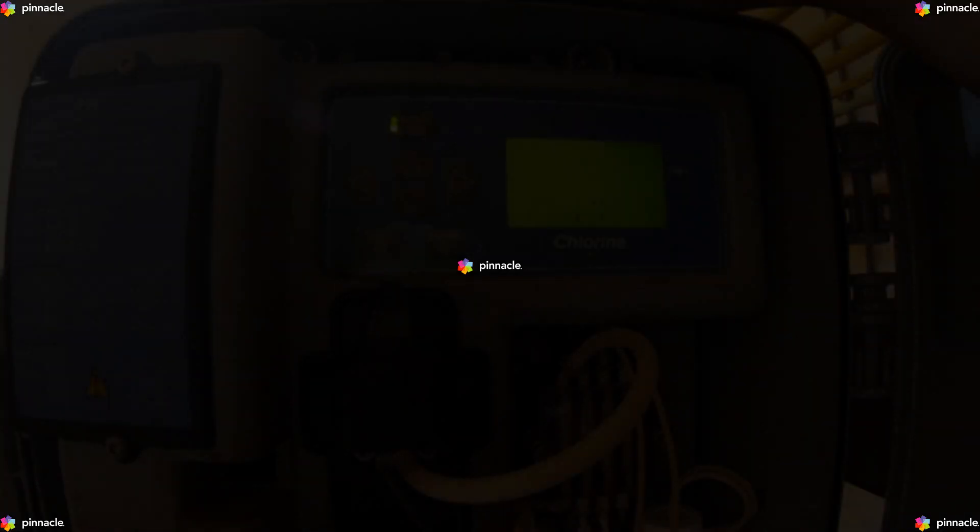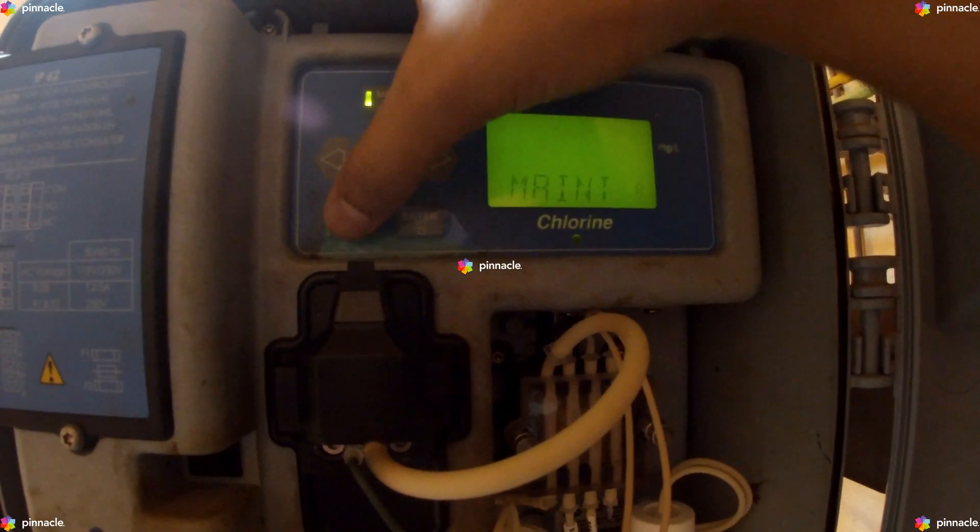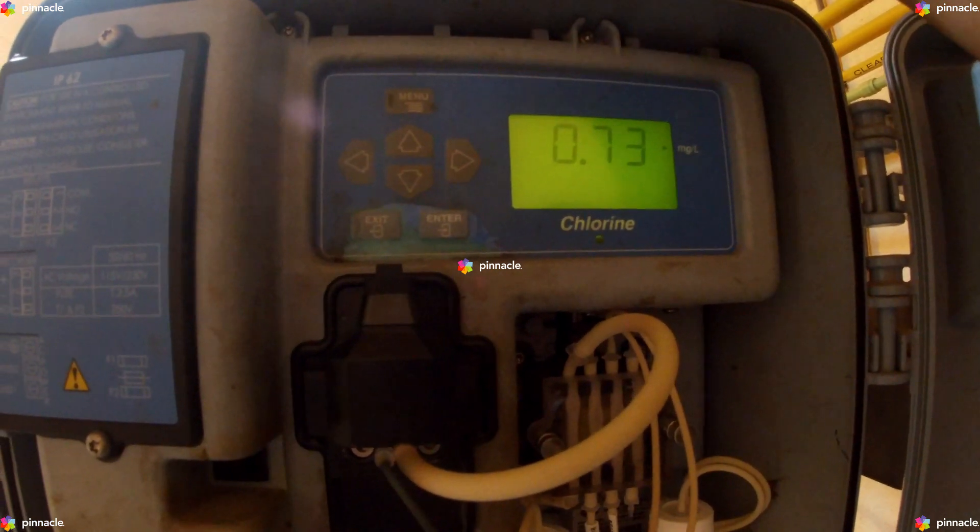To terminate the prime cycle before all 39 cycles are complete, press Exit. The analyzer will return to normal operation.